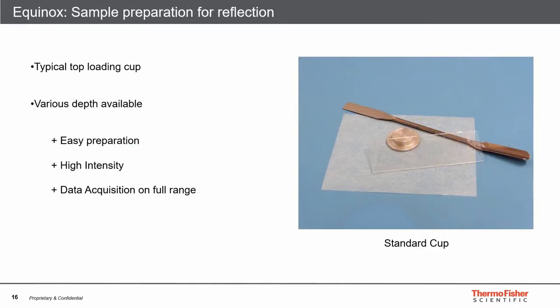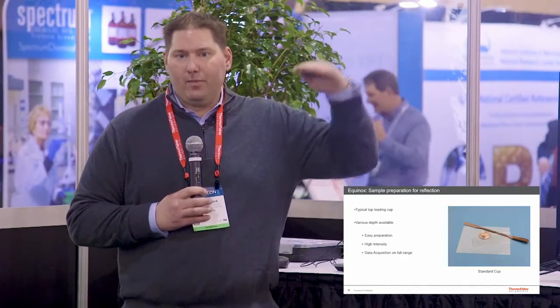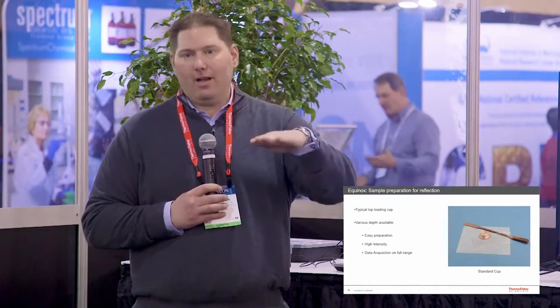Again, for sample prep, we normally just use a microscope slide and put the sample into it, and we want to keep the powder even with the outside edge. That gives us our height from X-ray tube, the sample, to detector. Shifting that height, we'll actually see a shift in the peak positions. So it's very important we keep that height very exact.